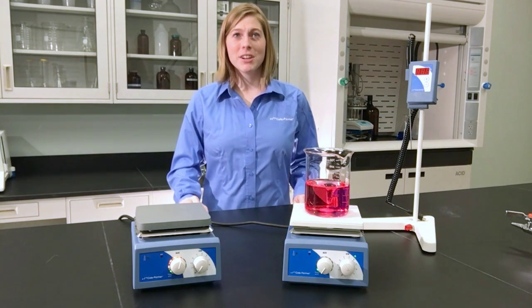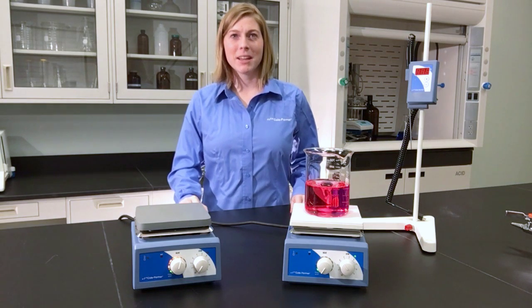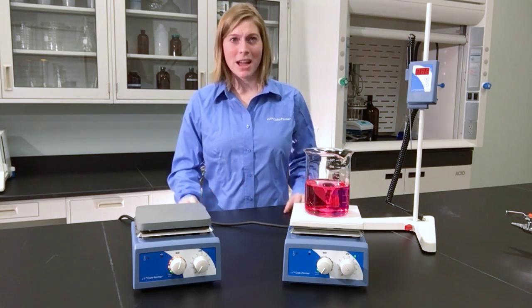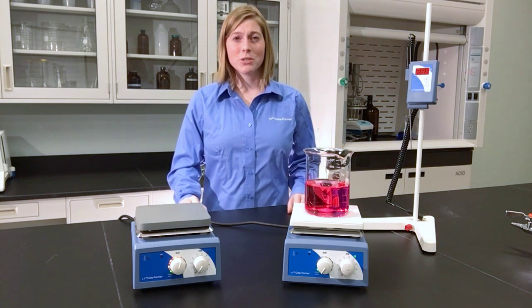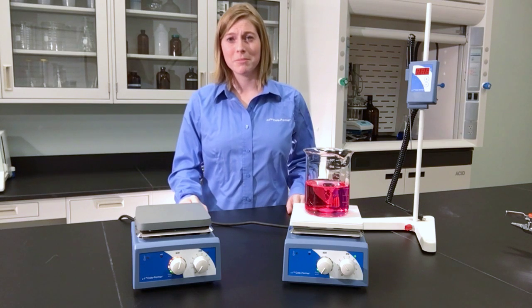Hey everyone, I'm Becca, here to tell you about our line of Cole-Parmer Hot Plates and Stirrers. These advanced models feature an intuitive design that's easy to control, saving you time. The stirring units reach up to 2,000 RPM and the powerful magnet keeps the stir bar from dancing around.